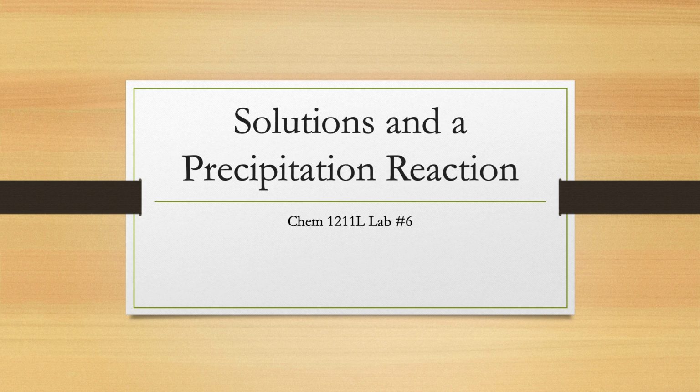This week's experiment, we're going to be taking a look at solutions and precipitation reactions and really focusing in on how we actually make solutions. So getting some familiarity from a lab standpoint with how we typically go about making solutions, as well as looking at a precipitation reaction and some of the ways we write reactions for precipitation reactions, and also using it as a way to review some stoichiometry that you guys have probably been going over in lecture.